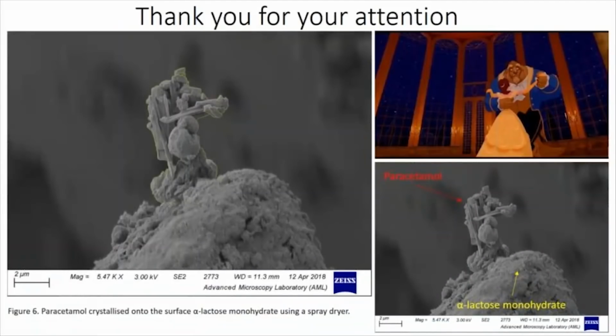Now, as I'm coming to the end of the allocated time, I'd better finish up. I hope you found this talk interesting and learned something new. The take-home message that I hope you have found is that spray drying is a very versatile technique, and with the right control can produce dried crystalline materials of your specifications and choosing. And thank you very much for your attention.